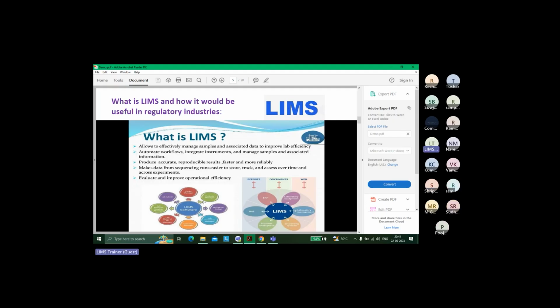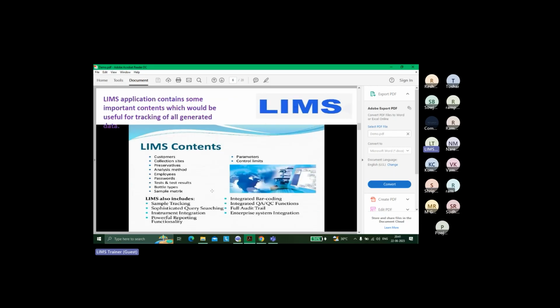And one more thing: it's not only that. We can connect LIMS with instruments; we can do instrument integration. We can connect it with chromatographic tools. Those of you who have worked on Caliber LIMS, there should be some integration with a chromatographic tool, so that it directly takes the values from the chromatography and pulls them into LIMS. In industry we use SAP and LIMS and chromatography CDS software linked with HPLC, the integration between these.